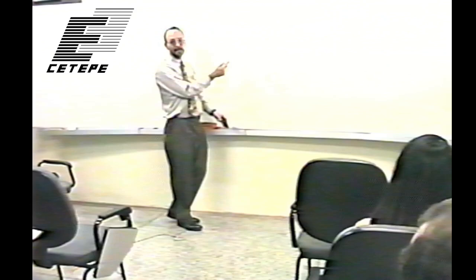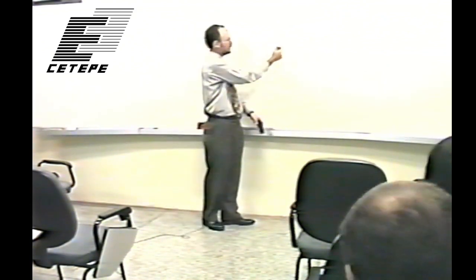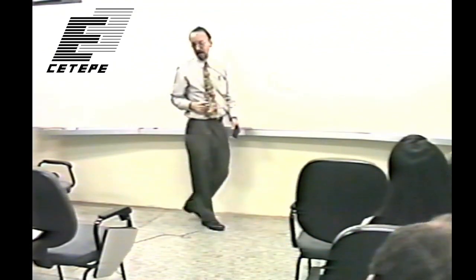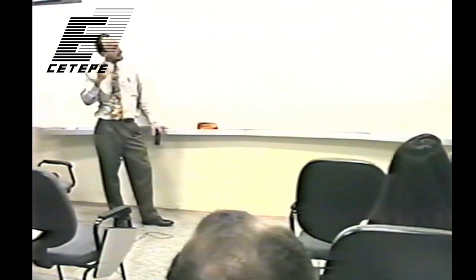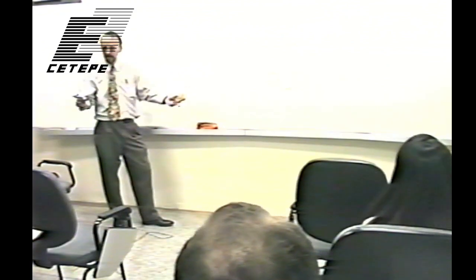And you can imagine, I told you that these screens are 100 to 500 microns thick, so you get a lot of these granules in here. But they are not very dense. They're only 9 grams per cc for a dense one. And they're very irregular, and they have this problem with spreading of light.